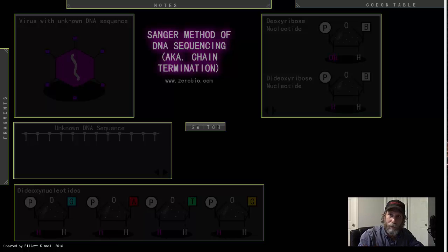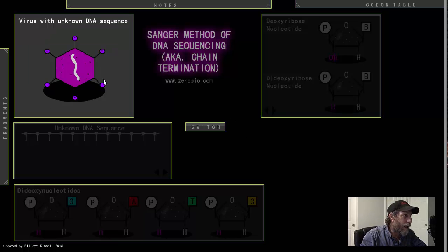All right, so I've created a little sequence of flash animations to do my best to illustrate this process to you, because I know it can be a little bit complicated. So imagine that we've got a virus here with some unknown DNA. So we've got a strand of DNA here, and we don't know what the order of the bases are. So we want to sequence this strand of DNA.